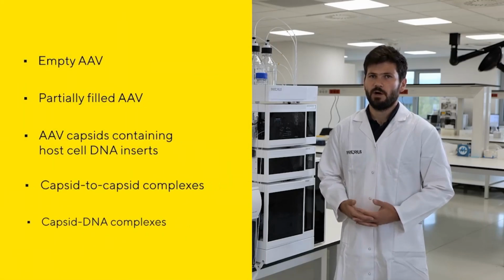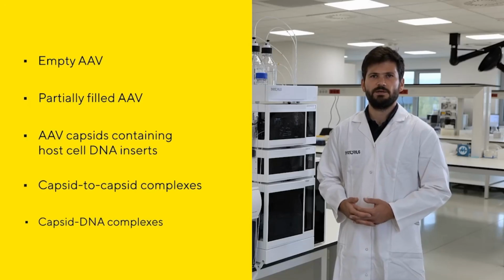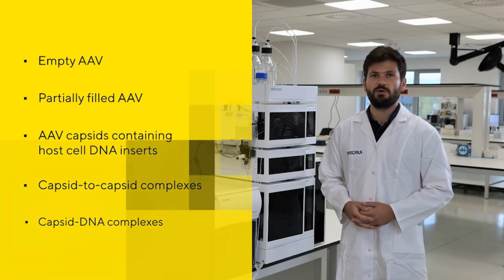Critical product-related impurities include non-potent AAV capsids such as empty AAV, partially filled AAV, and AAV capsids containing host cell DNA inserts, as well as capsid-to-capsid complexes or aggregates, and capsid DNA complexes.